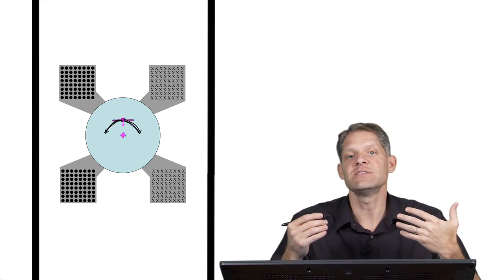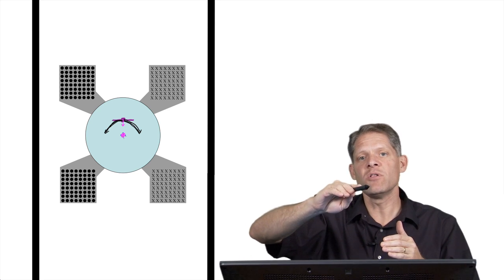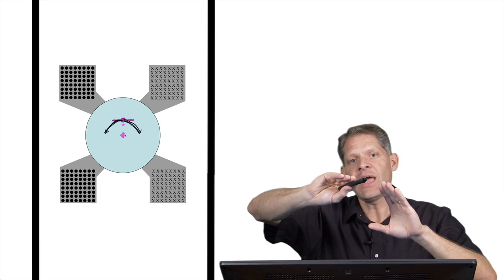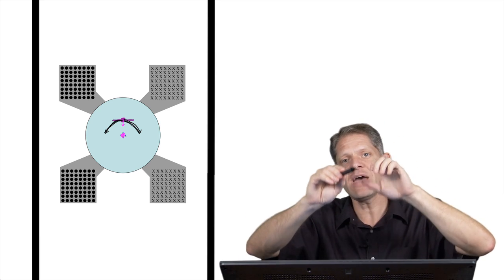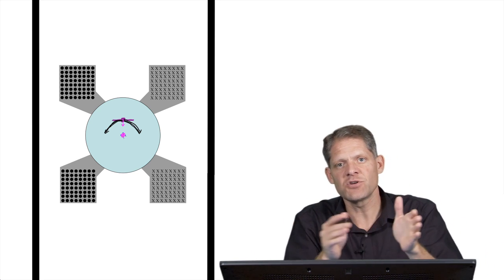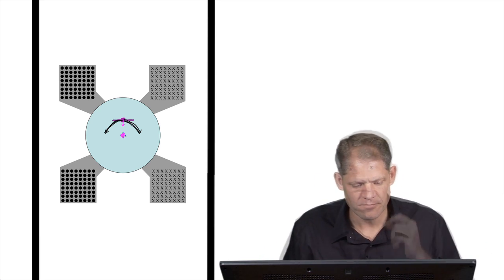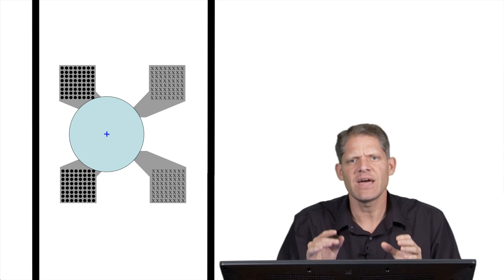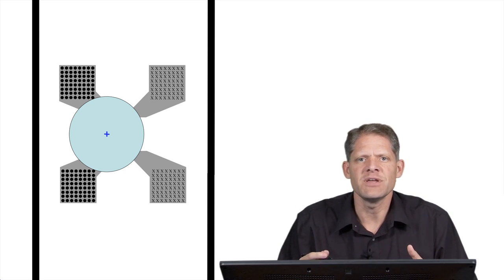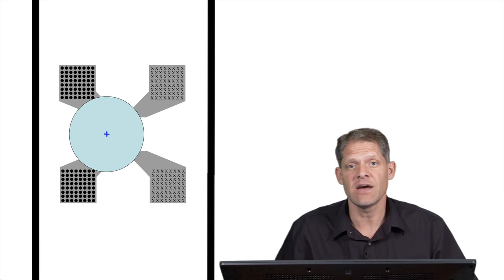And the way you can set your specimen at eucentric height is to wobble the specimen tilt and move the specimen height up and down until the movement of the image is minimized on the screen. And that's because your sample is right at that eucentric height where it doesn't move when you tilt it. Now what I just described was an ideal situation, and unfortunately nothing mechanical is actually ideal or perfect, at least not down to the 10 to 50 nanometer level.